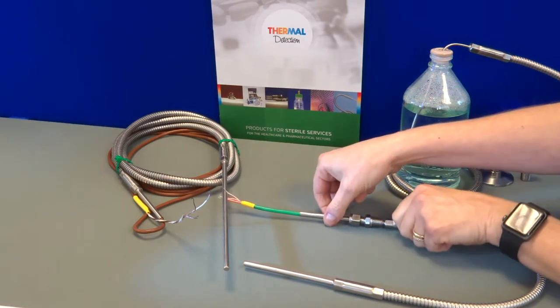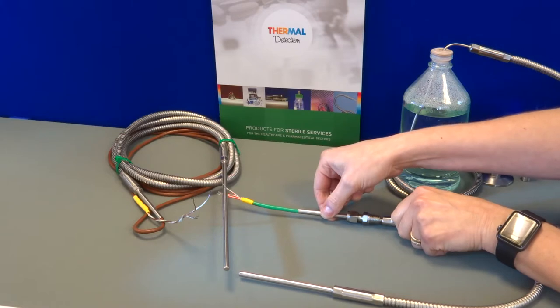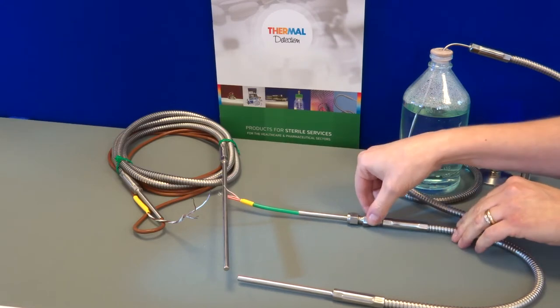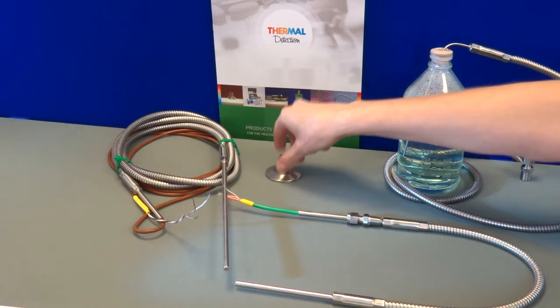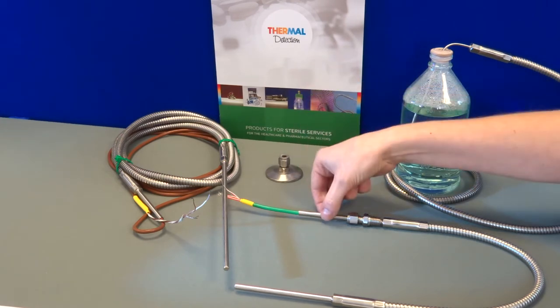Next we have the bulkhead tailpiece or the chamber entry feedthrough. The Steriprobe can be mounted on the autoclave sidewall or top by way of the fitting, whether that be flanged or threaded. Thermal Detection provide all types of fitting, but if you need a more permanent solution then we can weld to the tailpiece itself.